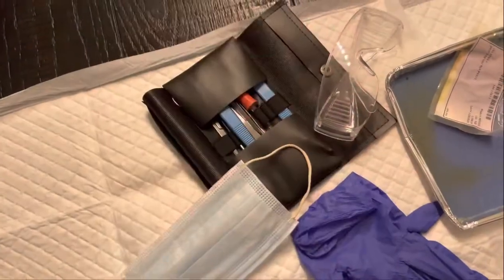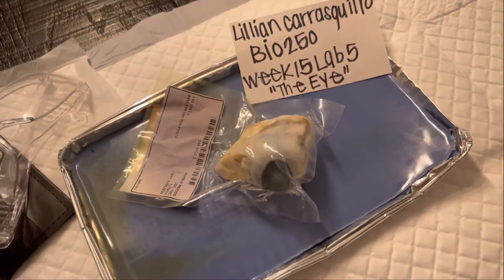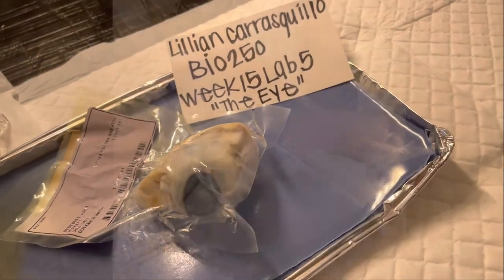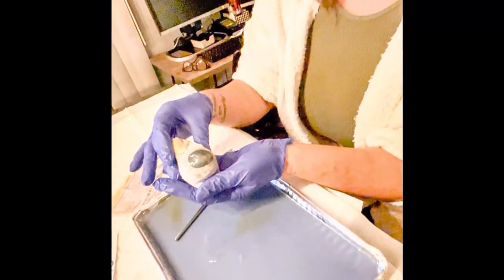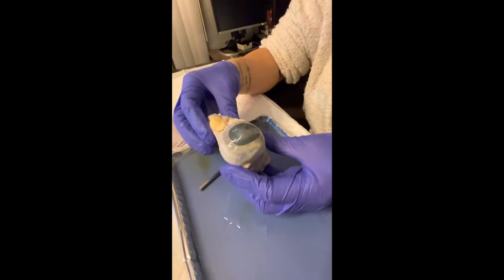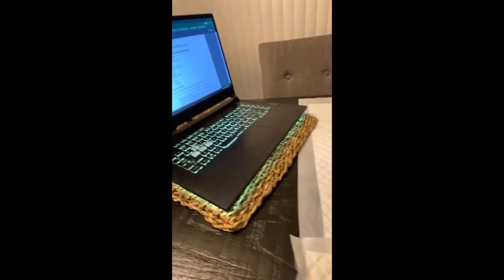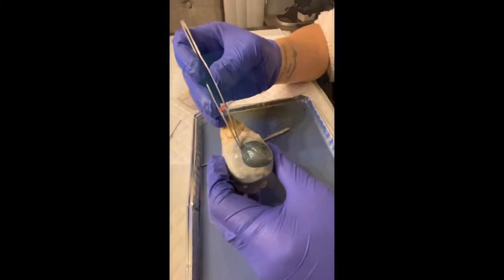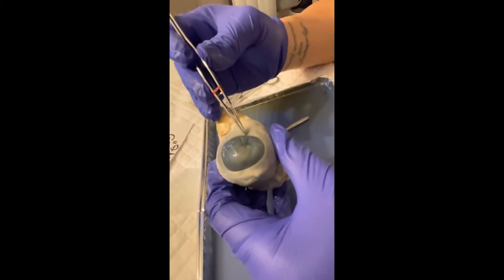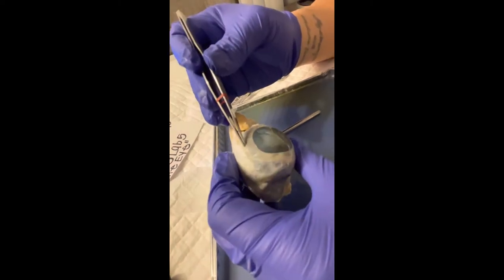As I began my lab, I noticed there were 5 exterior parts to the cow's eyeball, the first being the cornea. This is the clear dome-shaped type of lens and helps the cow's eye to focus light up to 80%. I consider the cornea as the microscope of the eyeball, which helps the cow's eye to focus on objects that are much farther away. In our case, the cornea is not hard simply because it's been soaking in a sealed, preserved packaging for so many weeks.